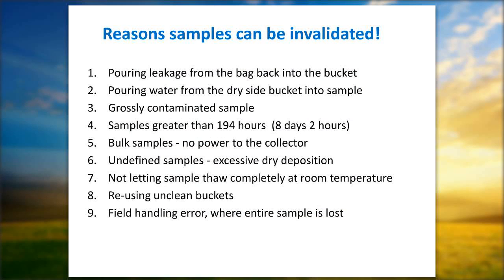Also, we had this recently here. The dry side bucket, for those of you with the older Aerochem style collector: any sample in the dry side bucket isn't the wet deposition measurement we're looking for. Don't ever pour that water into the good sample. Unless it's for extraordinary reasons, you shouldn't be decanting that and pouring it for us.